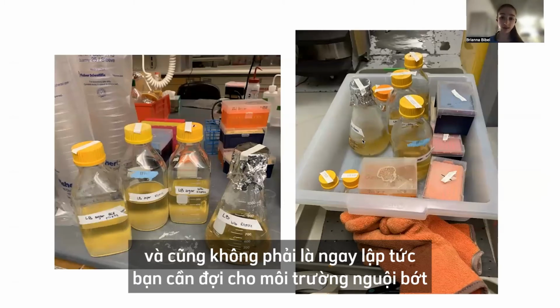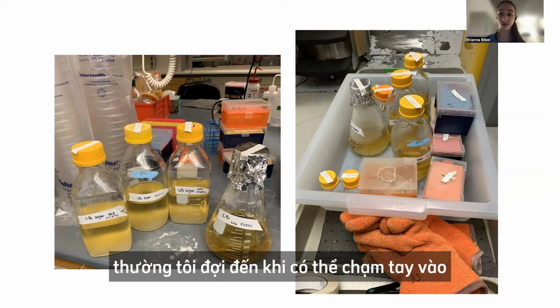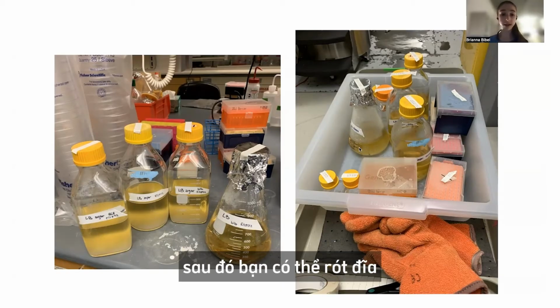And not just right after it comes out of the autoclave either, you're going to want to wait until it cools down. So typically I let it cool until you can kind of touch it before pouring the plates. And before you pour the plates, you're going to want to put in the antibiotic and mix it well so that the antibiotic is nice and mixed, and then you can pour your plates.